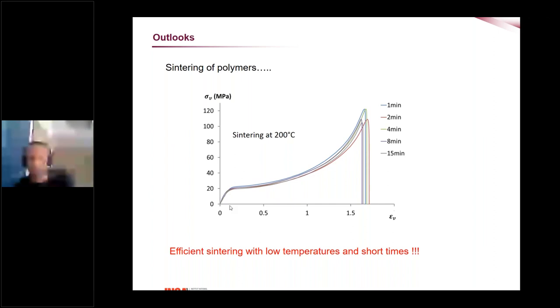I guess Julien is here in the participants. He was one of my PhD students who was working on that. At very high temperature, we broke a lot of tungsten carbides, so we bought the pure tungsten ones. It was a little bit better.